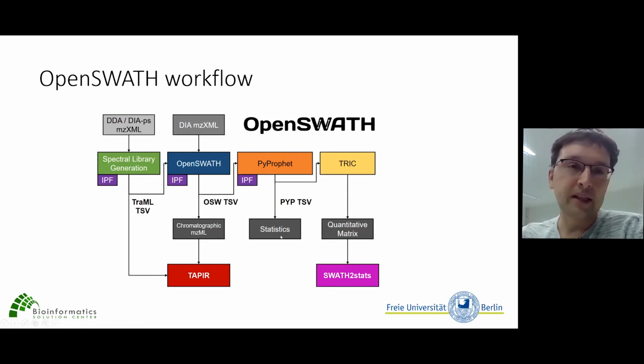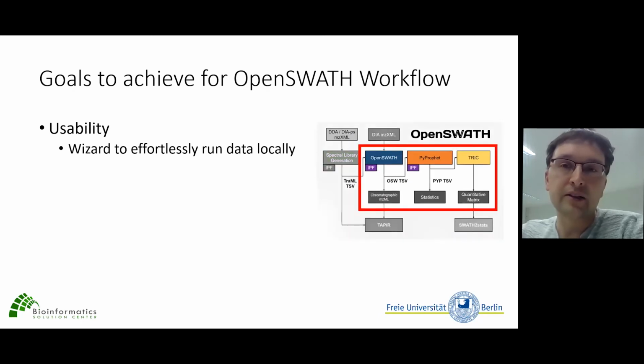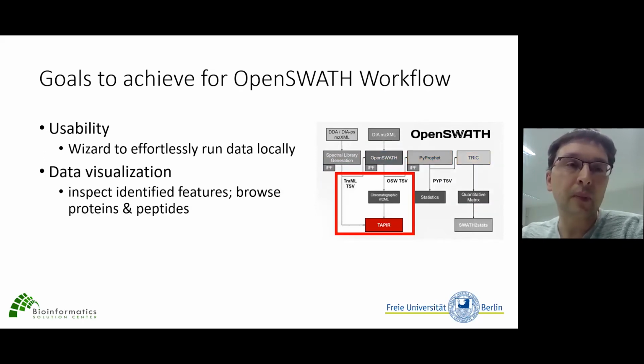And so where we tap in now with our CZI grant is to improve the usability of this workflow. The first idea was to use a wizard to run this pipeline for new users, because if you do this on a command line, it could be a bit troublesome. Also, you don't really know where to put what data, right? So we wrote a wizard to do that. That's concentrating on the highlighted part of the pipeline, so it subsumes all this and puts it into a nice GUI.